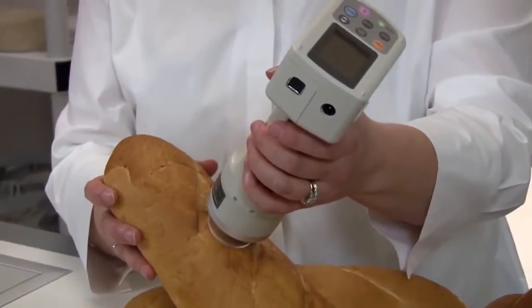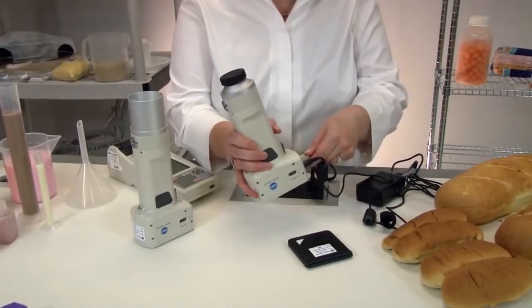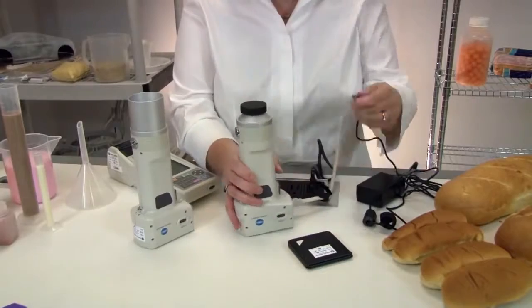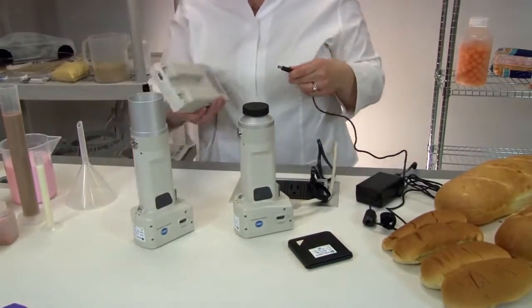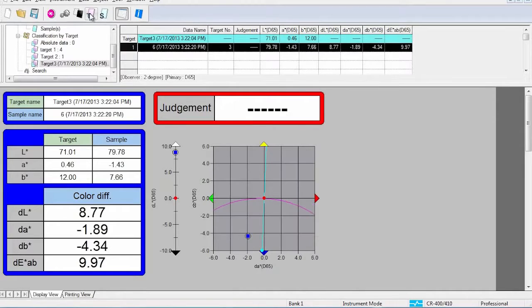The CR400 series is designed to store up to 1,000 measurements internally or 2,000 when the data processor is connected. Even more measurements can be stored with optional quality control software SpectraMagic NX.